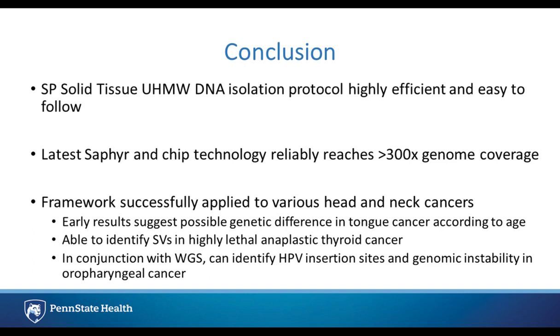So in conclusion, the solution phase cell and tissue high molecular weight DNA isolation protocol recently developed by Bionano is highly efficient, easy to follow, and much improved compared to the previous agarose plug method. And by combining it with the latest Sapphire instrument and chip technology, you can reliably reach greater than 300x genome coverage for these solid tumors. And I've been able to successfully apply this framework to a variety of head and neck cancers.